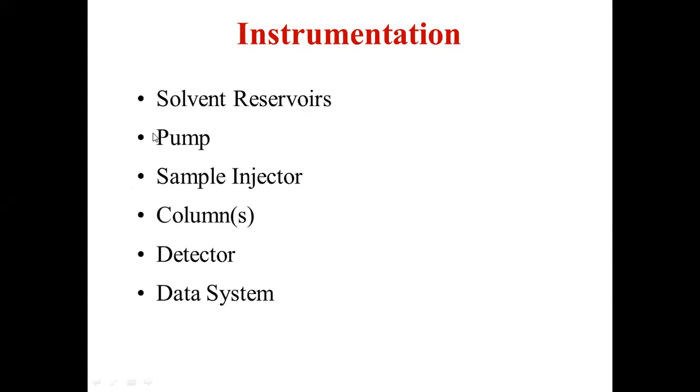Pumps are very much essential in high pressure liquid chromatography or high performance liquid chromatography, because pressure needs to be created. This creation or application of pressure is mainly done by the pumps. A variety of pumps are used, so let us see what kind of pumps we will use in the forthcoming slides.